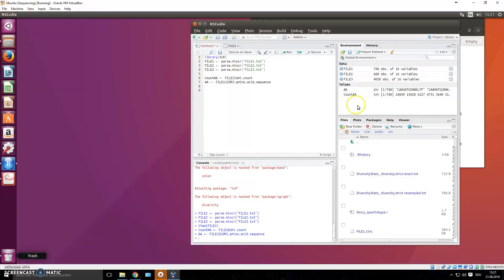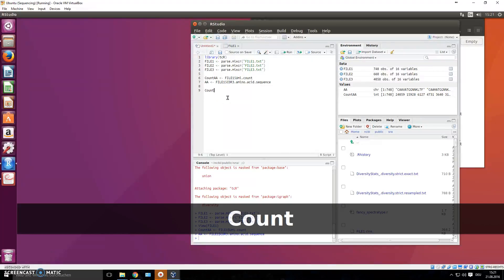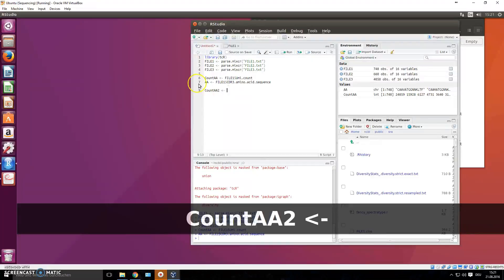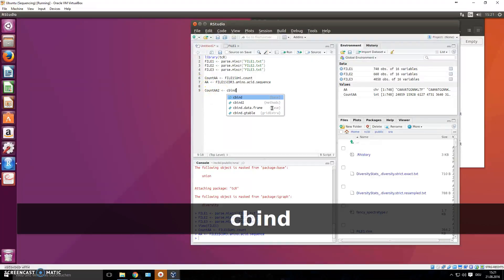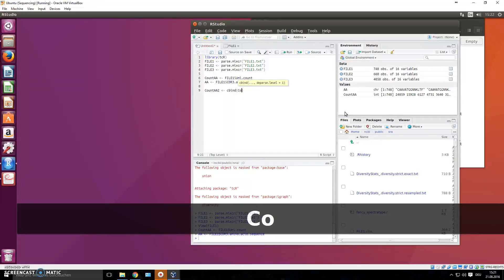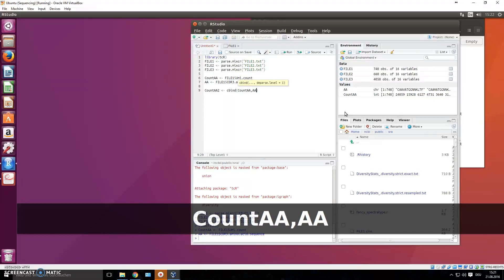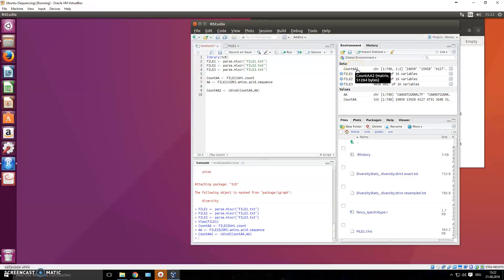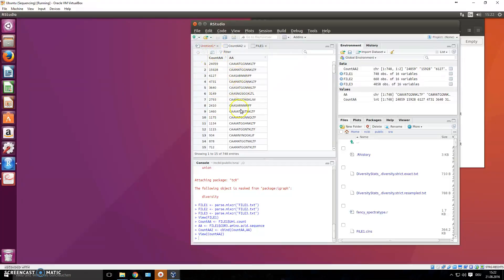Now you have these two new values in your global environment. Let's bind them together into one file using cbind - column bind. Assign this to a new object, let's call it count_aa2. Write cbind and choose the two values: count_aa and aa. Now you have this new object - click it open and you see a new table with the count and amino acid information.